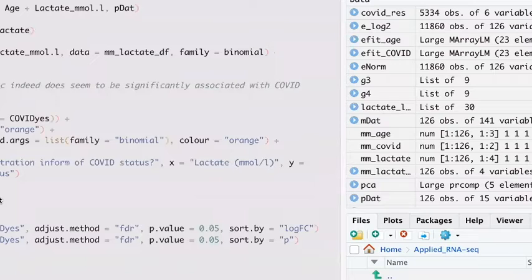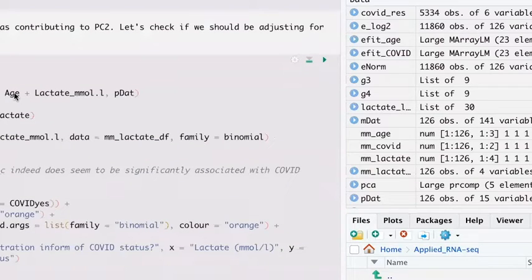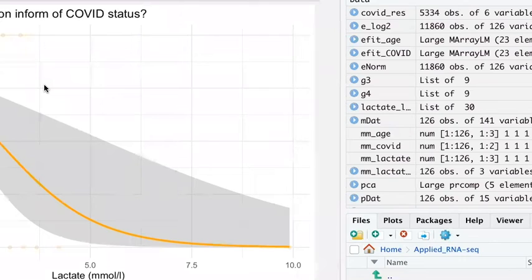So then, yes. Sorry, so in this example, you also included age. Yes, I did. So you can definitely just take it out. We can do it without that. Actually, I don't know why I had it. I think it's just because I was running through the examples and we know age doesn't affect it, but we can very well just take it out. Does that reflect in the plot? Let's see. So I just removed that. It doesn't, because that's exactly what we saw, right? In the previous example, it doesn't seem to be contributing to the expression that we see.